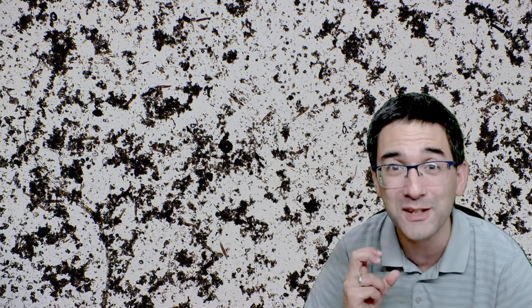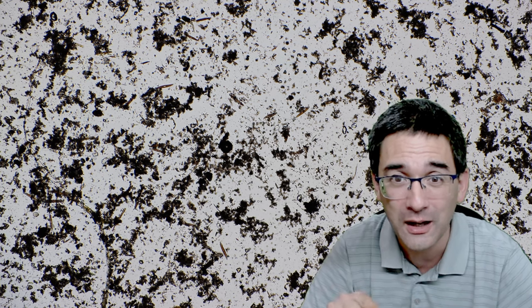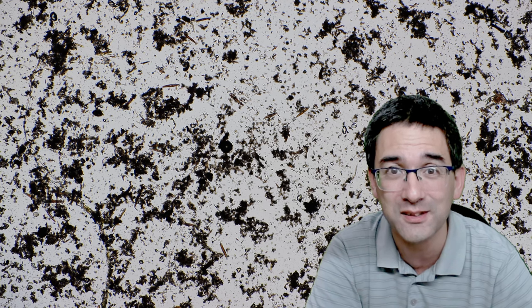And I'm going to also make myself disappear from the corner so that you have the full video, the full screen. Are you ready for this? It's actually quite surprising. Look. This here is now 20 times faster, and look what's going on here.